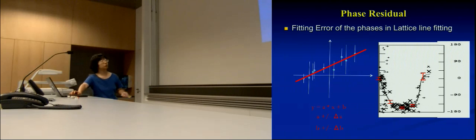Same thing here. If I'm sampling at the same distance as my envelope, then this error bar that's shown here will be doing the same thing, because as I said, the parameters are the amplitude and the phases at each position of 1 over d, 2 over d, and 3 over d, etc. So this is the error determined by how well all these points around it are fitting in. Okay, it would be a little different.